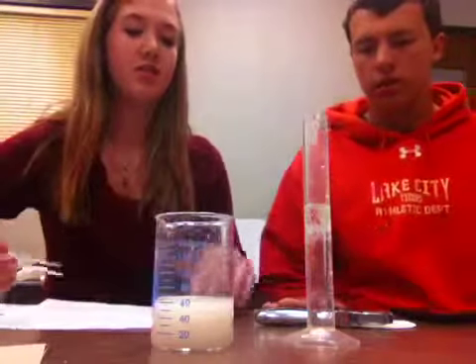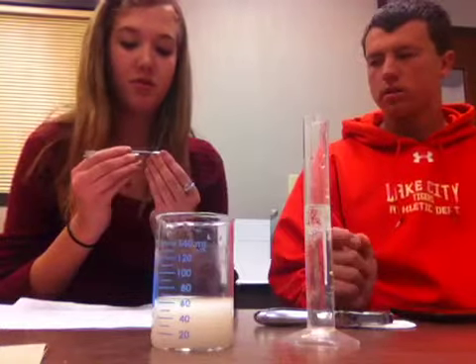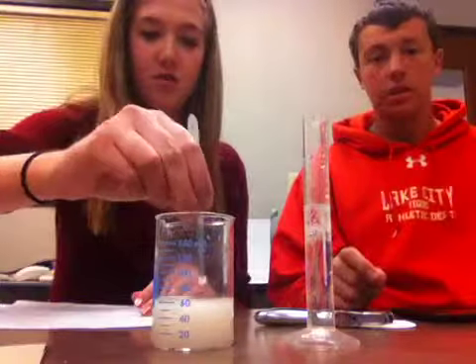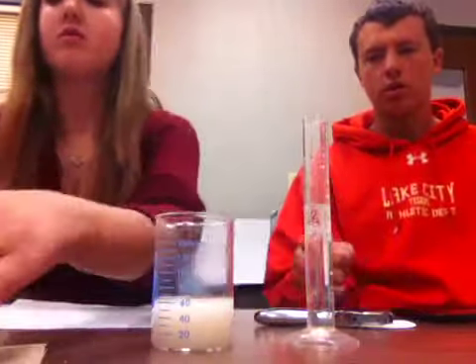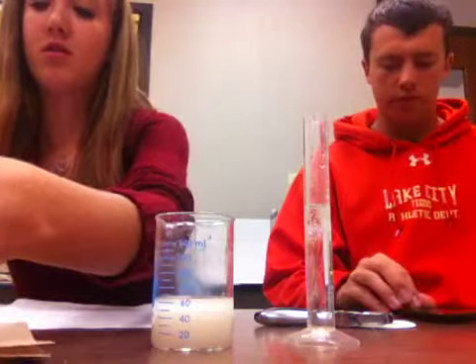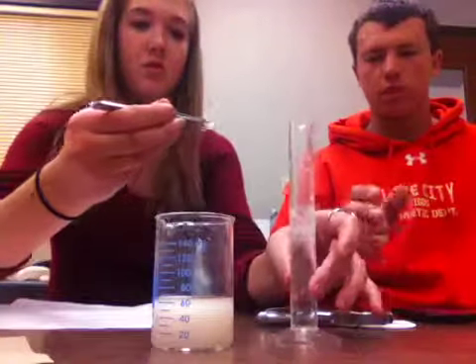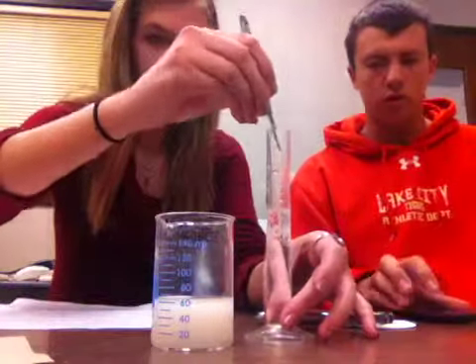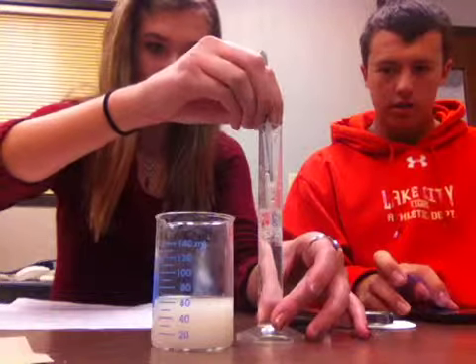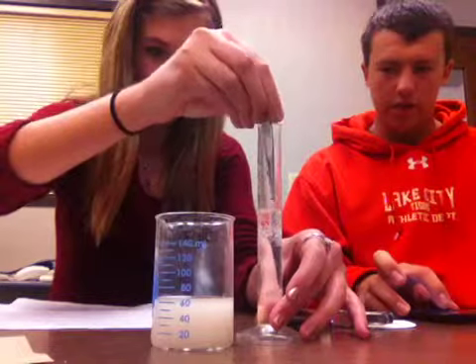So now what Lydia is going to do is she's going to take one of the small discs of filter paper and dip it into the yeast solution. And then she's going to blot it dry on the paper towel. And then as soon as she drops it into the graduated cylinder, I'm going to start a timer to see how long it takes for the disc to sink and then float back up.